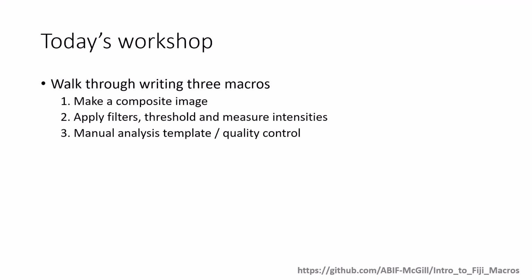We're going to be doing this on the demo images, so the DAPI, phalloidin, and mitotracker. These might not directly apply to your work, but hopefully as you look into this a little bit more and consider your work a little bit more, you'll be able to tease apart these little chunks, these little lines of code, blocks of code, and apply them to your work. That's the hope over time.